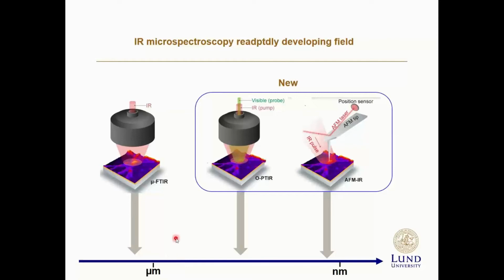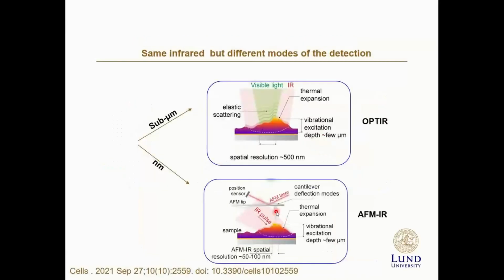However, infrared spectroscopy was reborn for structural study in neurodegenerative disease by using new techniques that recently came to be used, such as optical photothermal infrared and also nano-infrared spectroscopy. The new techniques allow us to better detect amyloid proteins and their structure, allowing sub-micron and nanometer resolution.